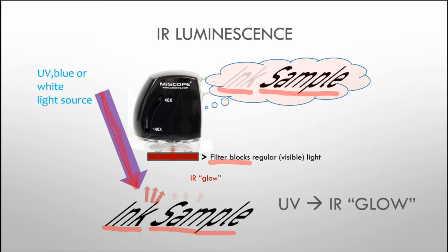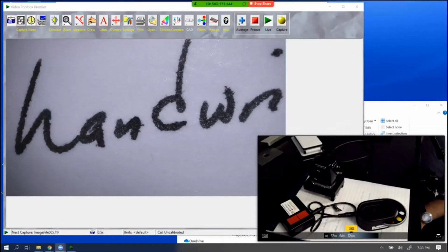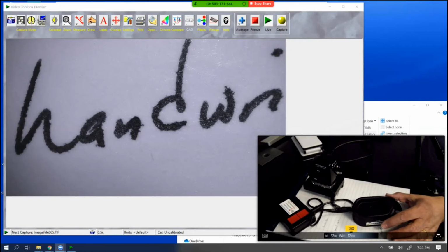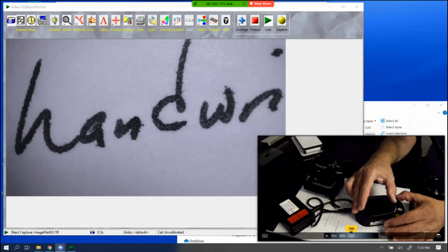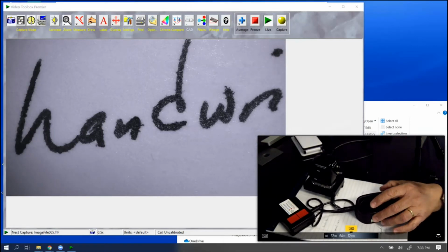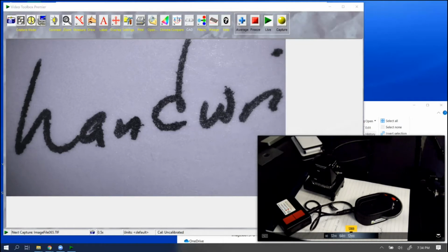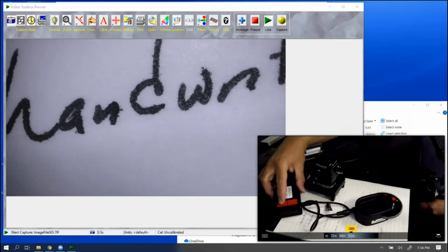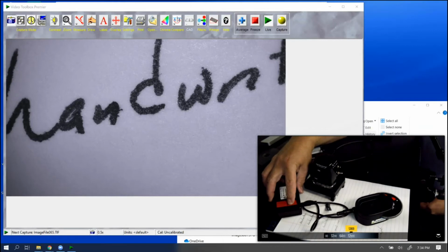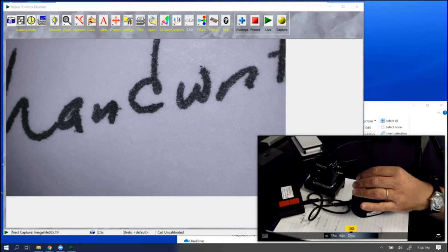So now let's actually take a MiScope and a filter wheel, and let's see how this all actually works. So we're back to our live image here again. And this time we've brought over our filter wheel. So this filter wheel has two different excitation light sources. As I mentioned, we have a UV light source, we have a deep blue light source, and then we have 8 filters. The light switches here allow us to switch to the different light sources. And the filters we can flip through.